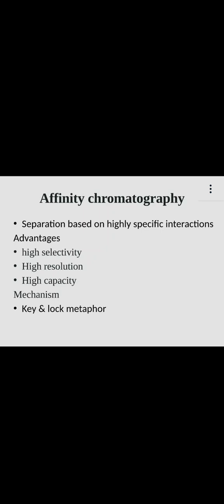So these very unique or specific interactions may include interactions like those between receptors and ligands, enzymes and substrates, antibodies and antigens. So those are the kind of interactions that are utilized in affinity chromatography.